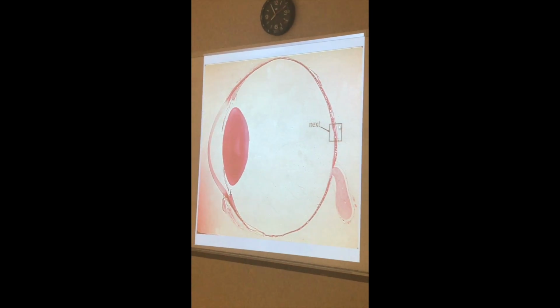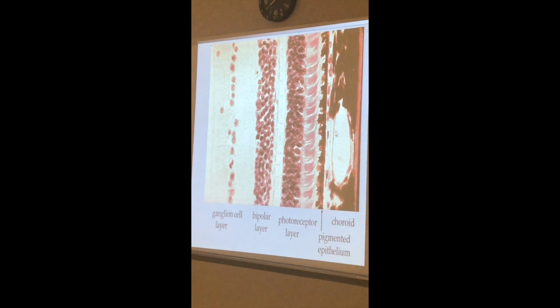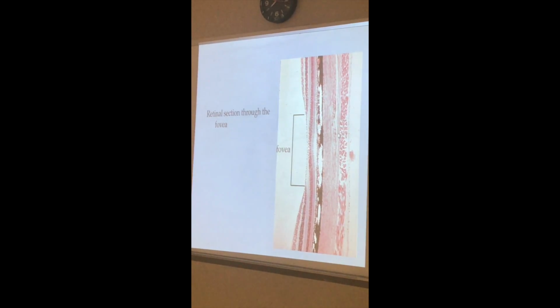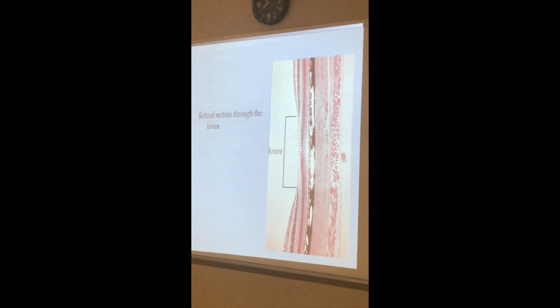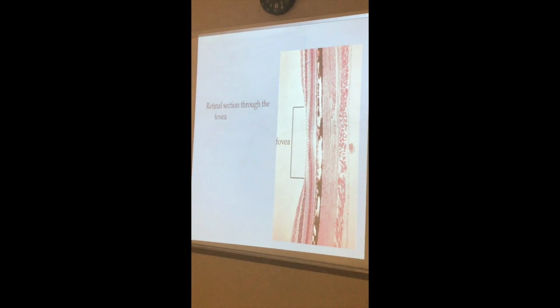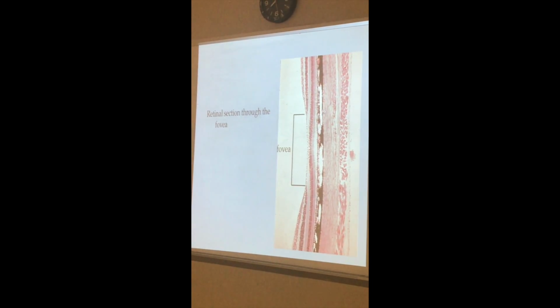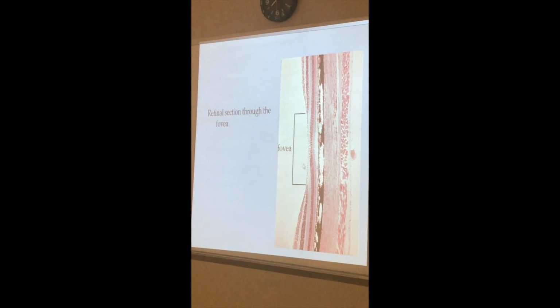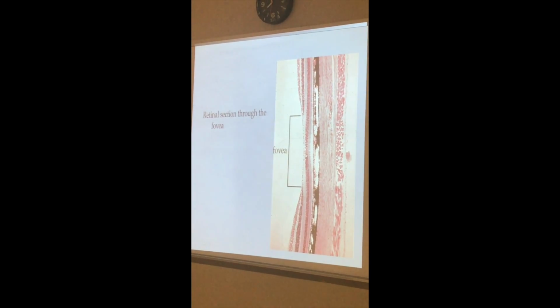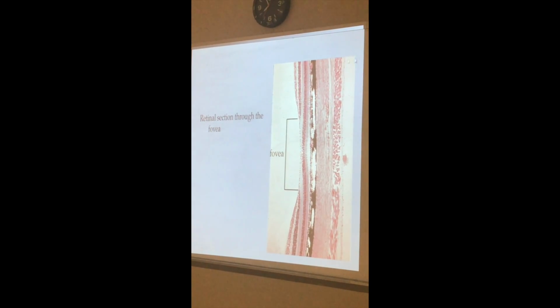So now let's take a look at the macula lutea. Here's the macula lutea. From here to here is the macula lutea, which means that this is mostly cones, some rods. And can everybody see that there's something different about this? This is the fovea. It only has cones here. Now, let's look up the top here.